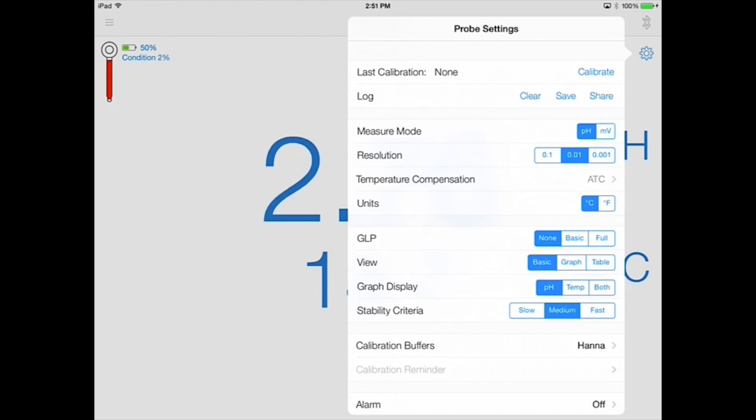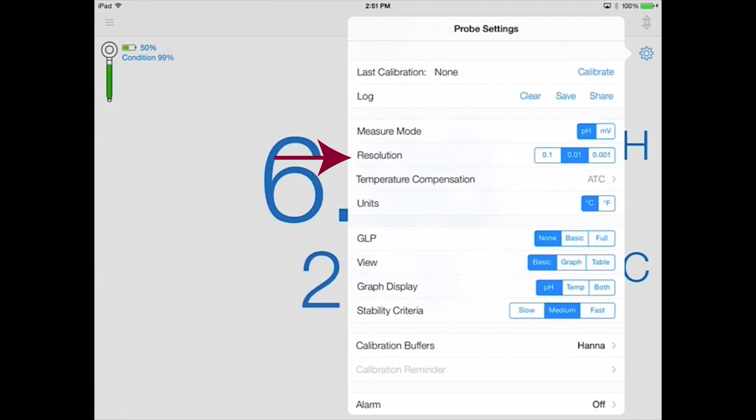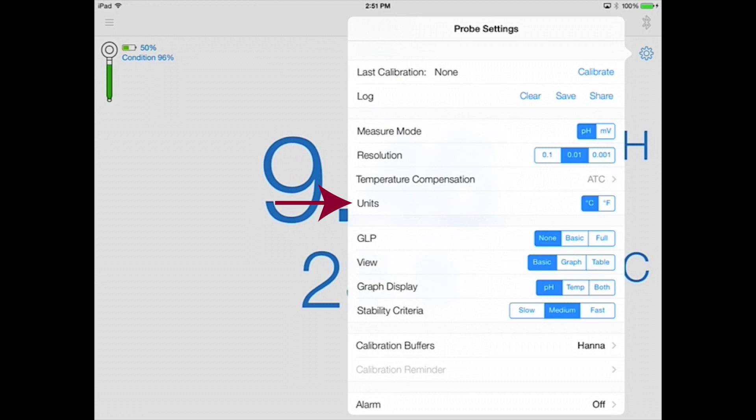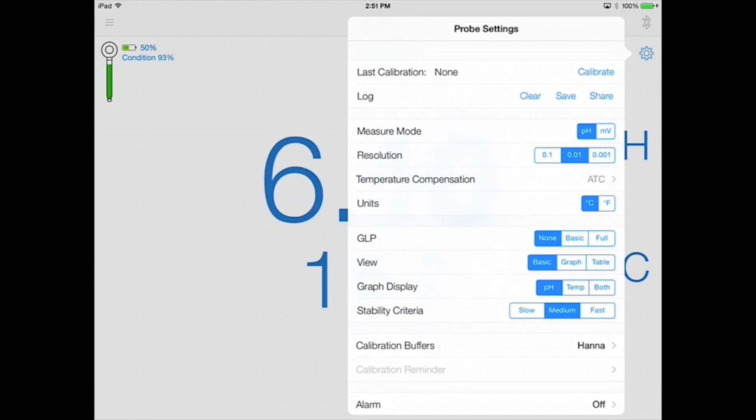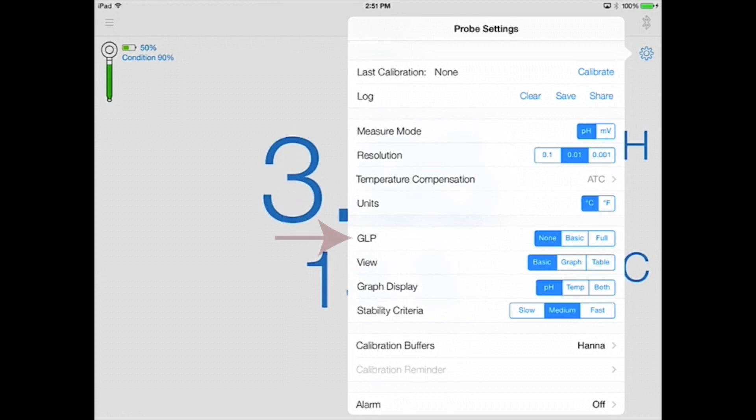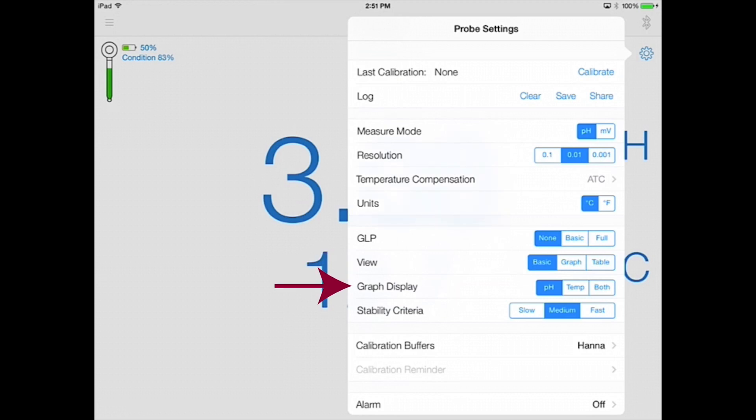There are options to adjust measurement mode, resolution, temperature compensation, and temperature units. You can also adjust what is displayed on the measurement screen. There are options to view GLP and calibration information, and also options to see a live measurement graph or data table. You can select the stability criteria for an electrode measurement.